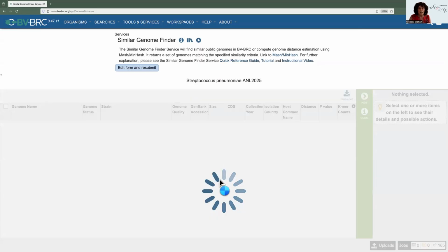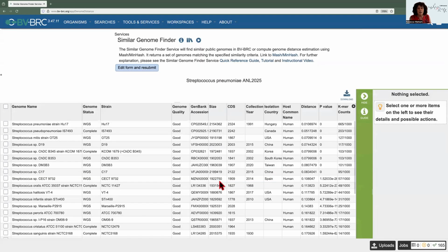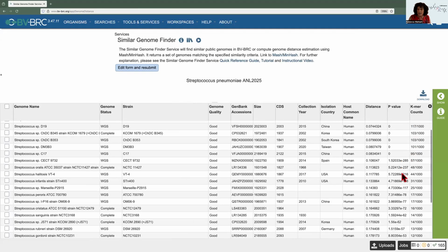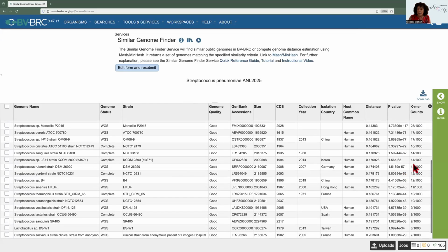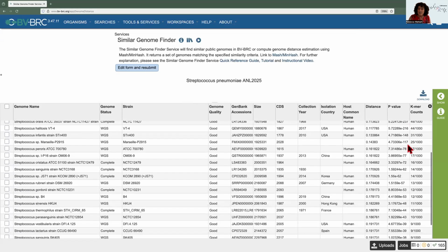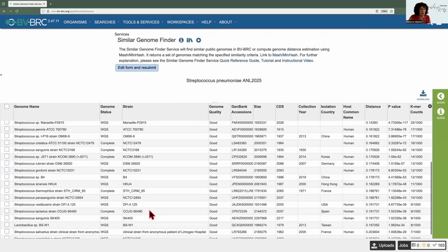So let's click on search. And now we wait. And I often like to get the circles while I wait. Oh, that was pretty fast. Okay, so let's look at this and let's give us more room. These are the top hits, but look, it gets pretty distant pretty quickly. And so it's the top 50 hits. And what I mean by distance is look at the total number of k-mers shared with this particular genome. 65 out of 1,000. And then the numbers get smaller and smaller and smaller until we even get outside of the genus range.